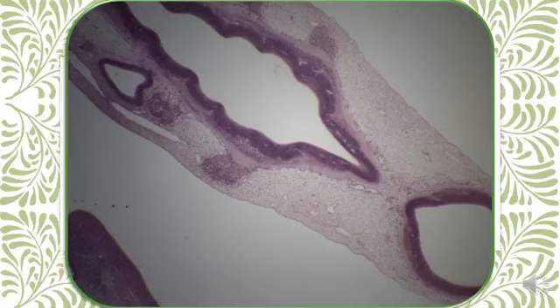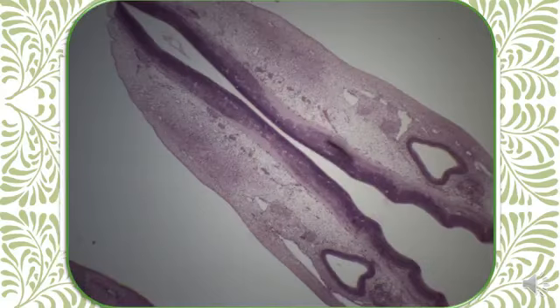While caudal to the ear vesicle here, caudal to the ear vesicles, this is the 9th and the 10th cranial nerve.